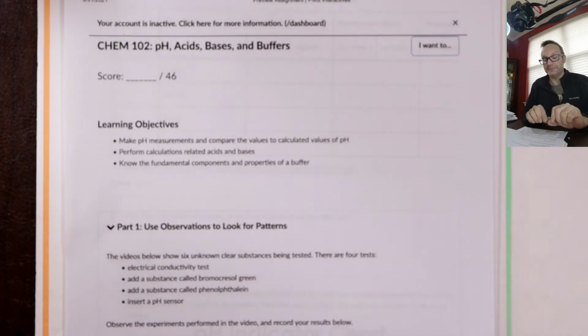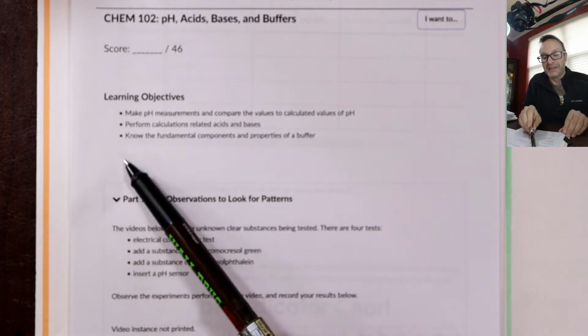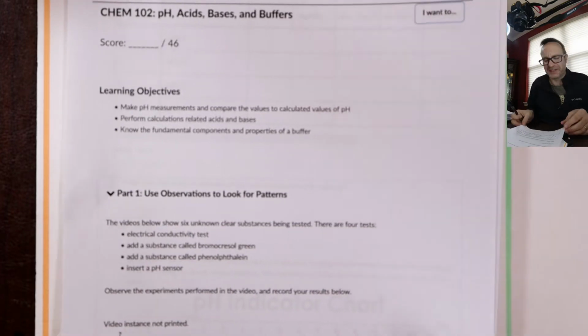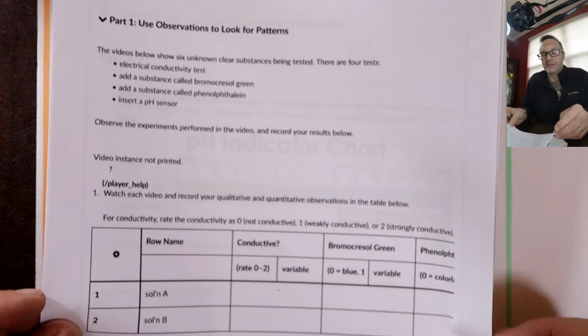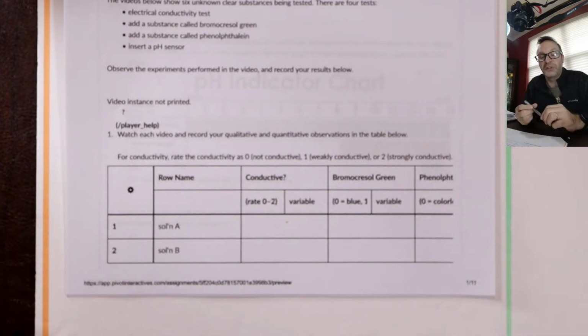Okay, so learning objectives, well, there it is. pH measurements compared to calculated values of pH, perform calculations, fundamental concepts of a buffer. Okay, so that's later actually. The first part's pretty straightforward. So one of the first tests you'll do is an electrical conductivity test.